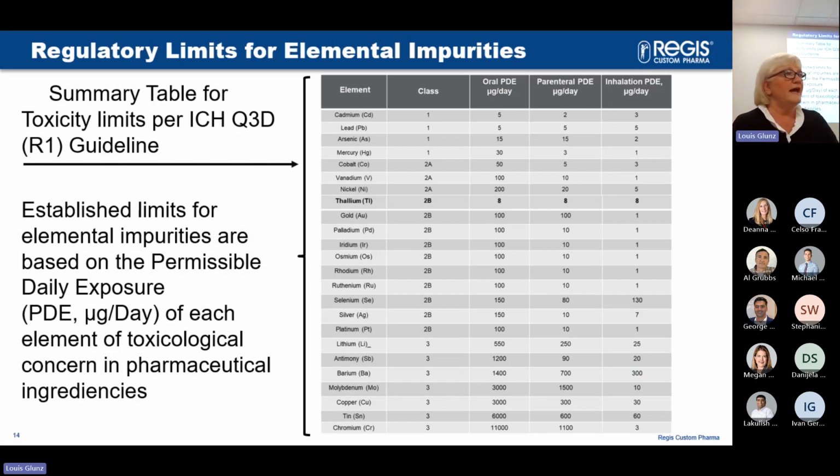So I work all the time with those limits. I calculate the concentration of my elements when I do my study based on this table.